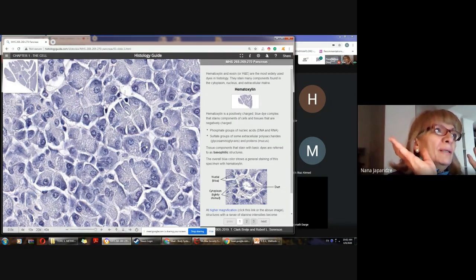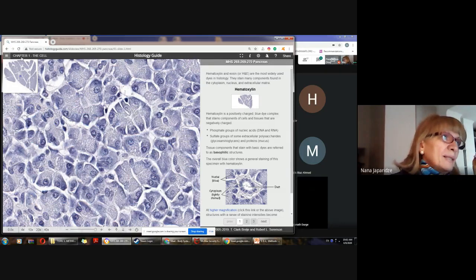For example, epithelial cells, and here we have epithelial cells. Especially secretory cells have a mostly round shaped nucleus, or it might be oval shaped, and quite a big amount of cytoplasm surrounding the cell.